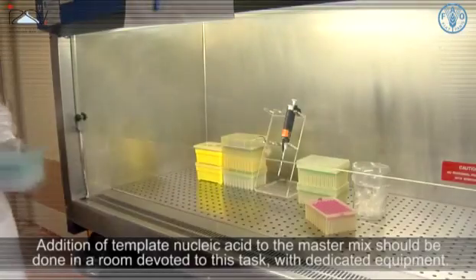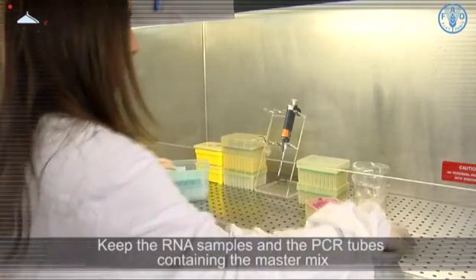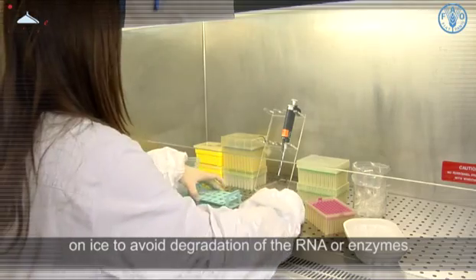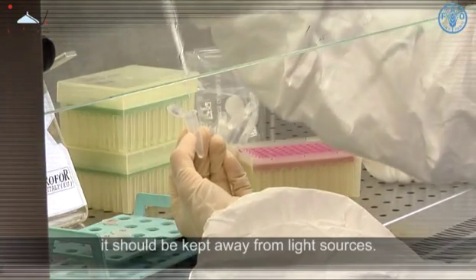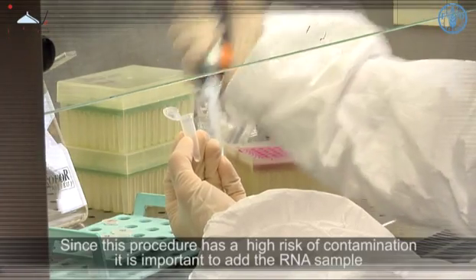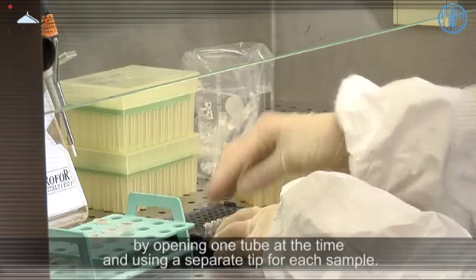Addition of template nucleic acid to the master mix should be done in a room devoted to this task with dedicated equipment. Keep the RNA samples and the PCR tubes containing the master mix on ice to avoid degradation of the RNA or enzymes. Note that if the master mix contains fluorescent probes it should be kept away from light sources. Since this procedure has a high risk of contamination, it is important to add the RNA/DNA sample by opening one tube at a time and using a separate tip for each sample.